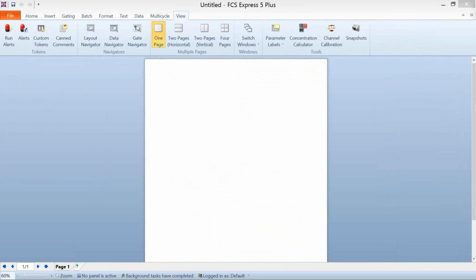Are you sure you want to resave this, because you won't be able to open it in version 4 again? So we've tried to put that in there. We did that when we upgraded from version 3 to version 4 as well, just to give the user the last check to let them know that they should maybe save this with a new name rather than overwriting the file that they had there. Got it. Thank you.